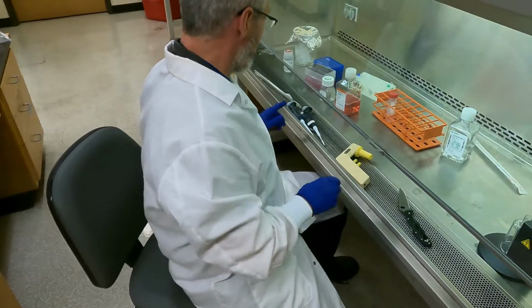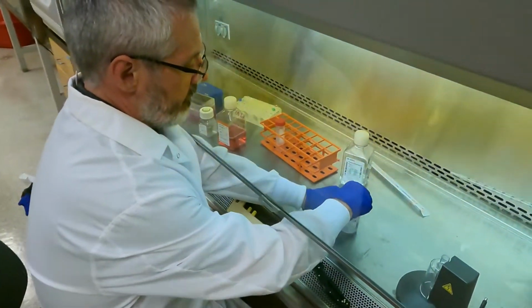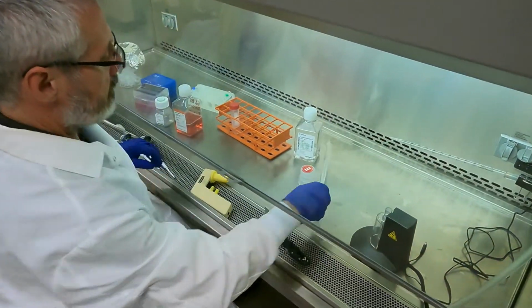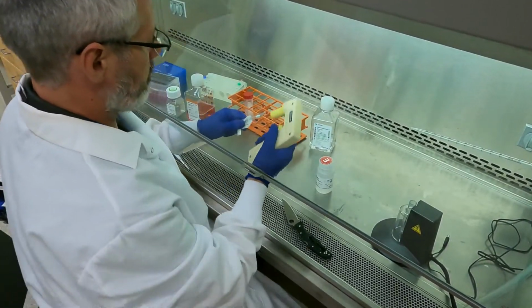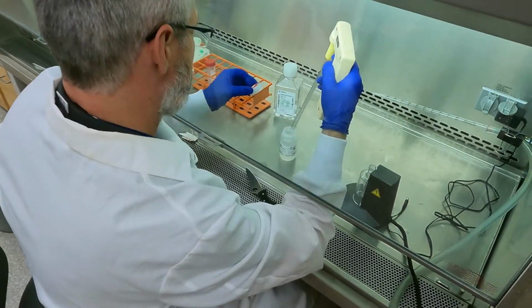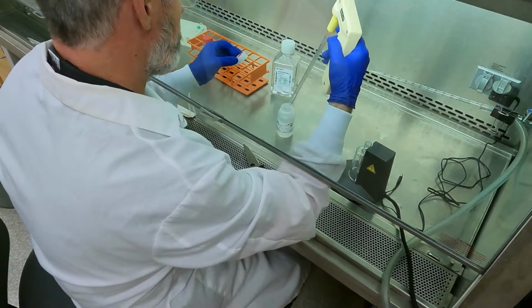Okay. Now we need to put 3 mils of buffer E in here. Put in Neon electroporation buffer E. One, two, three.